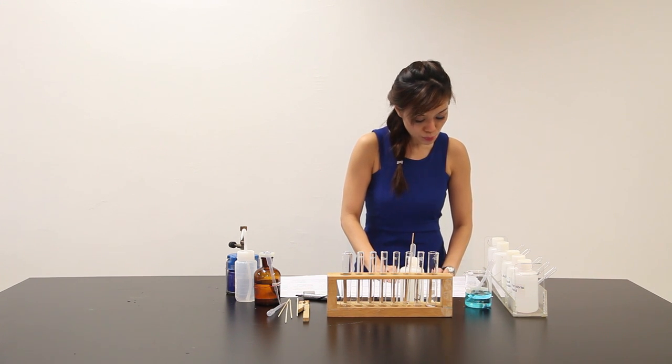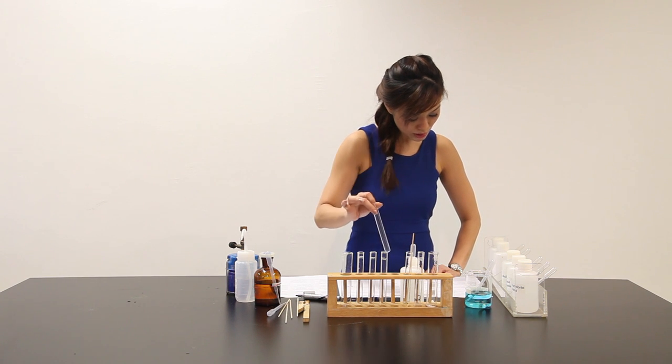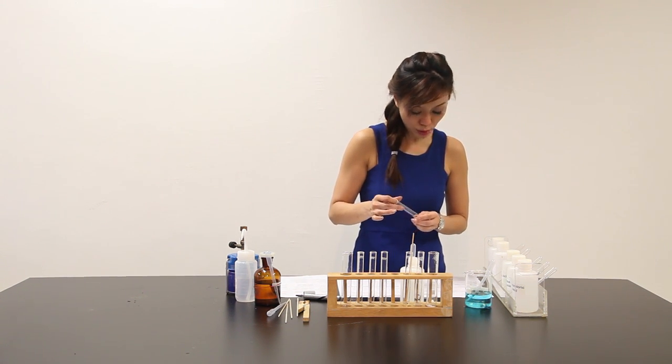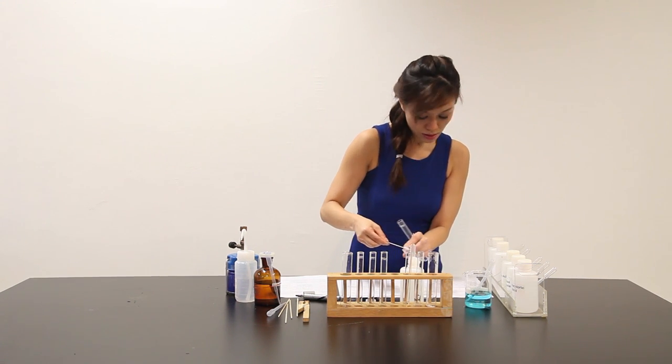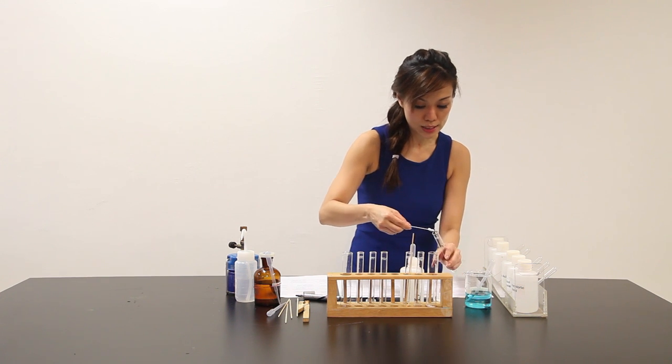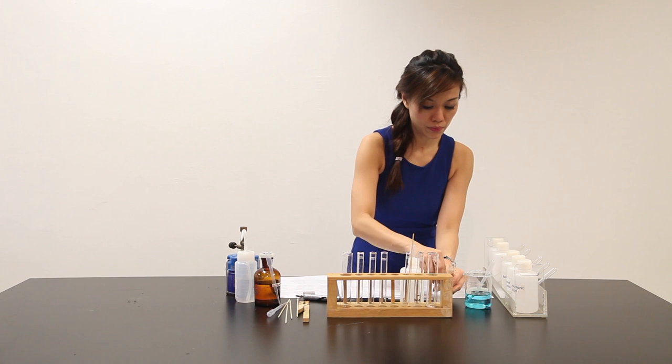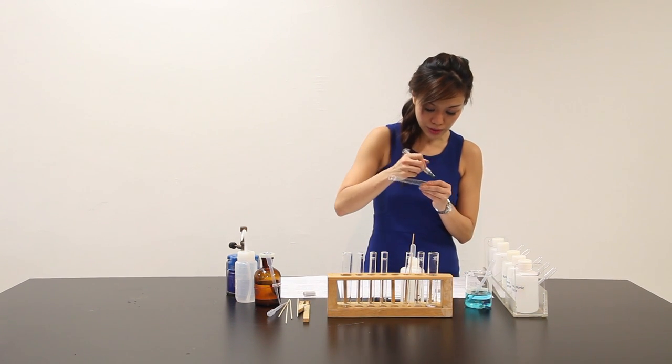Using the smaller tip of a spatula, transfer a small amount of solid X into a test tube and to this add about 2 cm³ of hydrochloric acid. So let me use this. A spatula full. 2 cm³ of HCl.